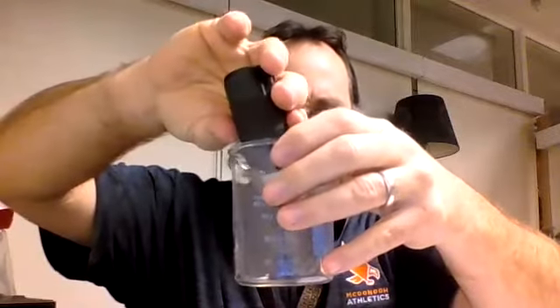And then I'm going to add some iodine to another beaker. This is a little small bottle of iodine. You can see it's a pretty deep color, pretty dark. However, it's actually not that dark. Let me show you here. It's kind of an amber color.